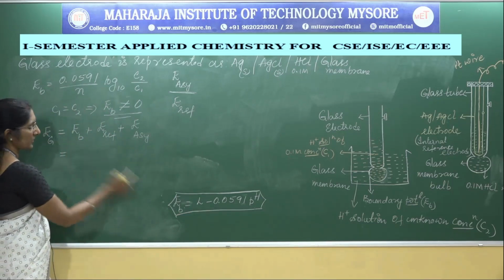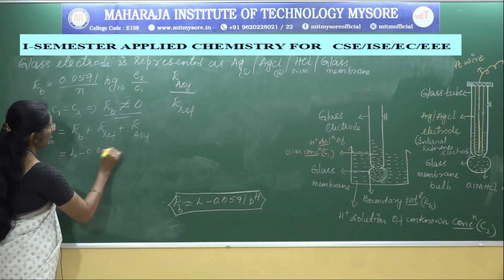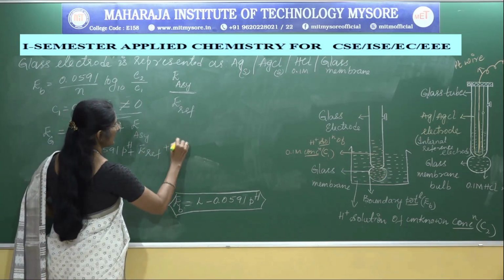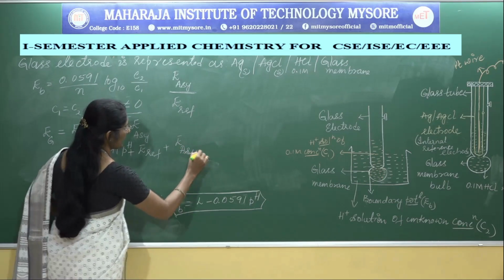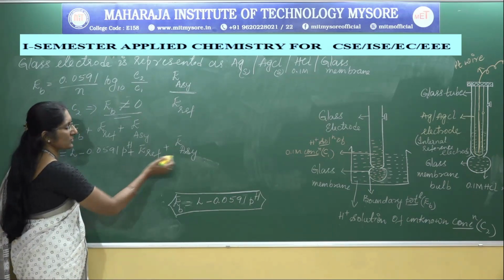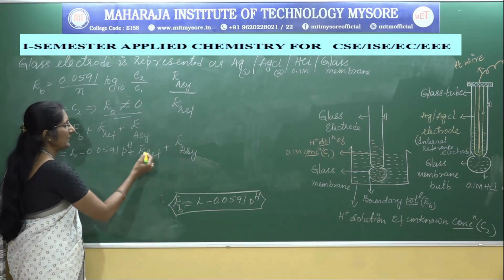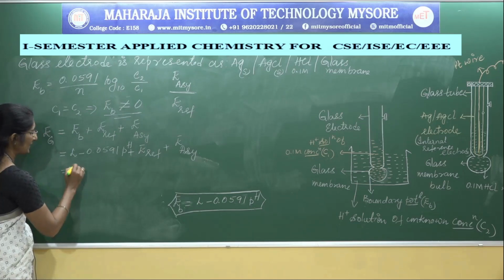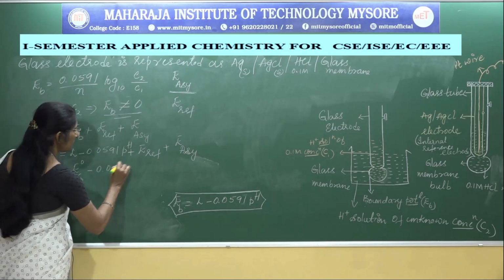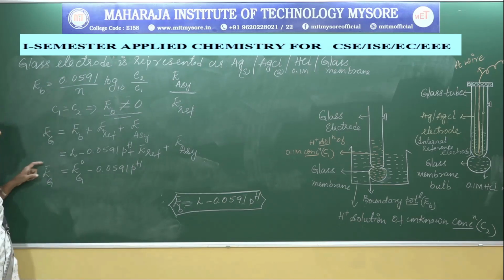Substitute the value of boundary potential. What is the expression for boundary potential according to this expression? It is L minus 0.0591 pH plus E reference plus asymmetry potential. Observe that L remains constant, reference electrode potential remains constant and asymmetry potential also remains constant for a particular electrode. So these three constants become another constant. Let us consider that constant as E naught G, minus 0.0591 pH. So what is the expression for electrode potential of glass?